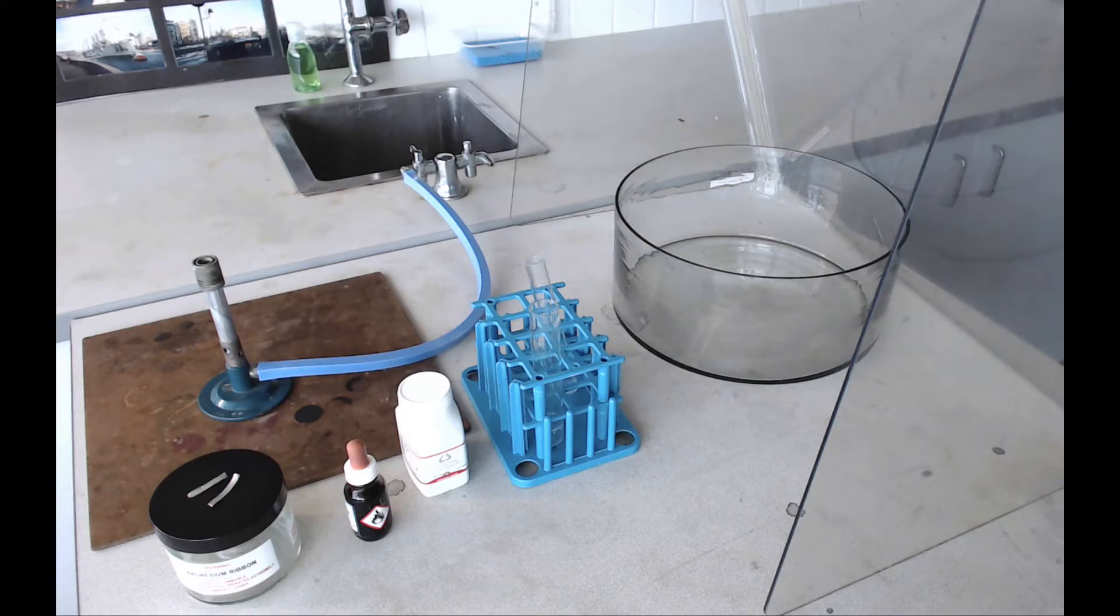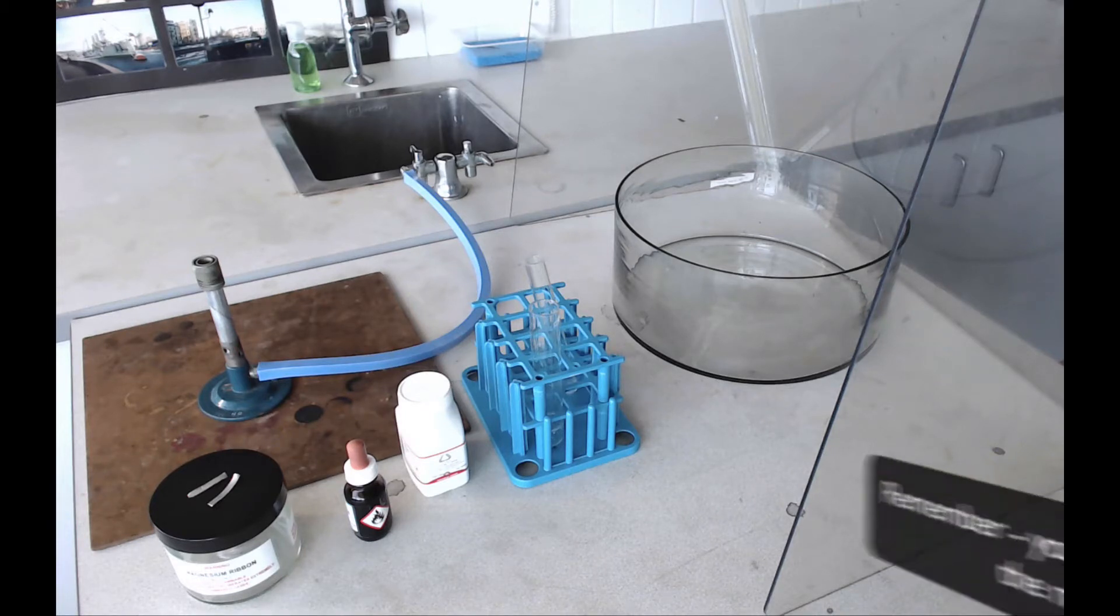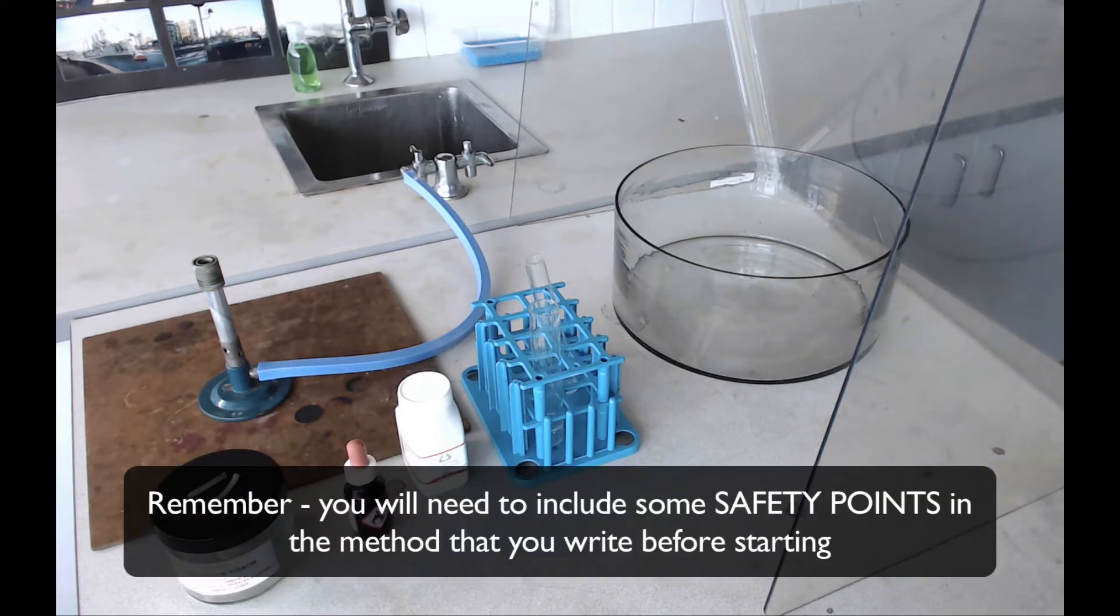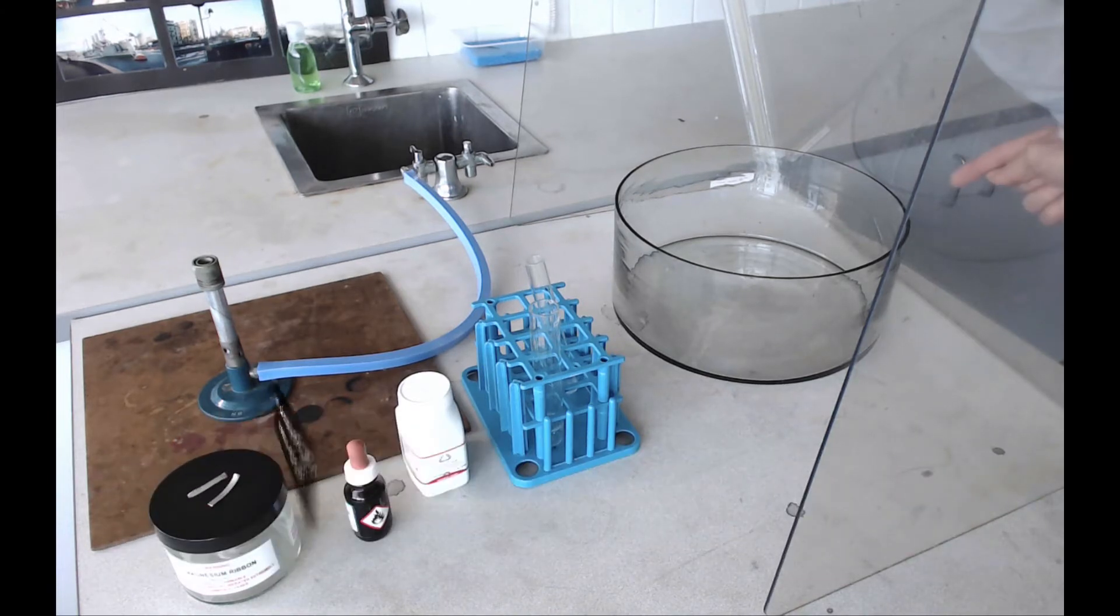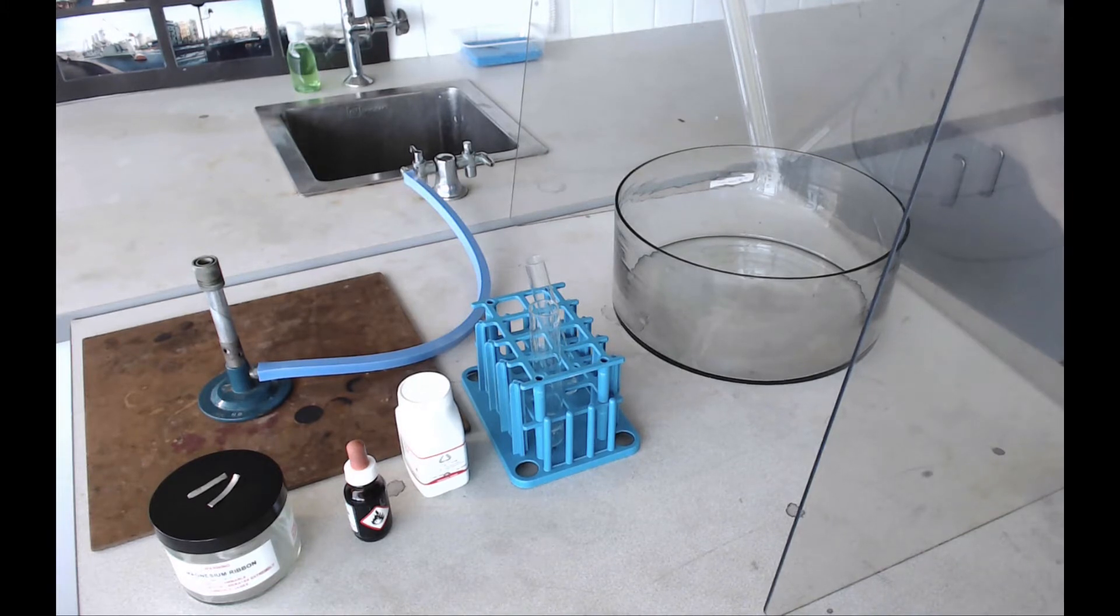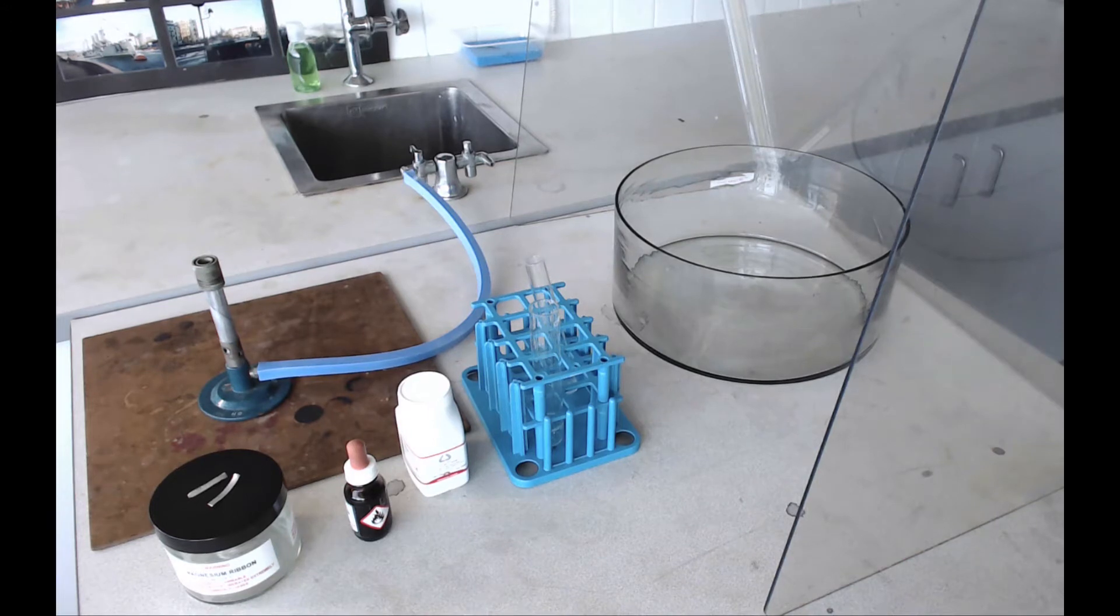All of the reactions involve reacting these metals with water. Lithium, sodium, and potassium shouldn't need too much encouragement. To be on the safe side, your teacher will demonstrate these in a trough full of water, so that big round container there is called a trough, and we've got a safety screen around it just in case any of these metals catch fire and jump out of the water.